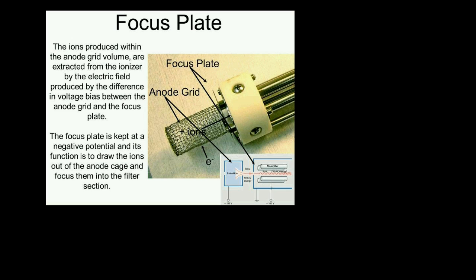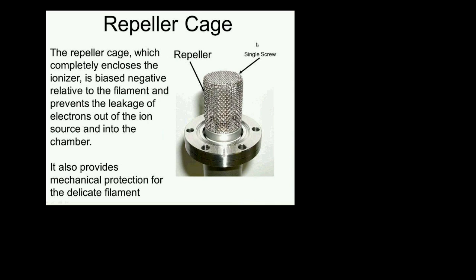It requires chemistry, which I'm a chemist, so it doesn't scare me, but it allows you to essentially refurbish most of the ionizers so that the next time around, rather than buying another ionizer, you literally do a swap. You can keep doing that in the future until things get so contaminated you can't use it anymore. So I hope that helps.